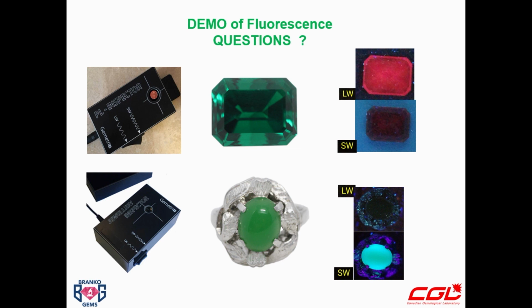Yeah, so for example, I want to show you on the top, this is that one glass that I was talking about, and this is a synthetic emerald. Just be careful, not always showing exactly the same fluorescence, but in this set here, for example, we put together 3 stones. I just did it because I was lucky to have a roommate who has a lot of stones like this. So in the center is natural emerald, on the right is flux, on the left is hydrothermal. It's a good reference collection, and we can see how fluorescence is different. It's more or less known with the weak yellow fluorescence in fractures in the natural. In the flux is medium red, and hydrothermal is weak red.